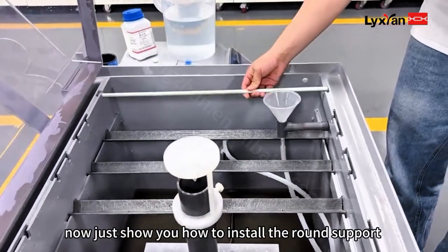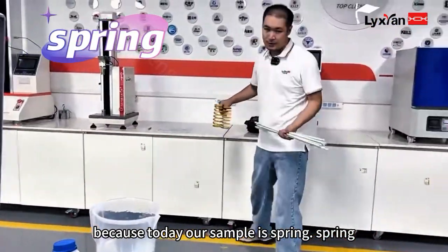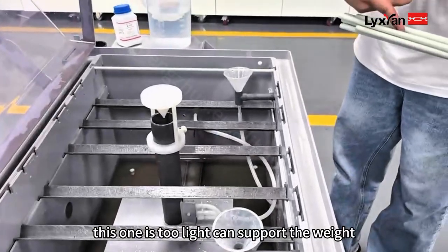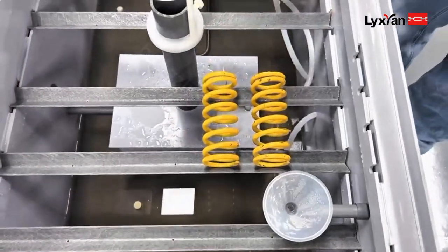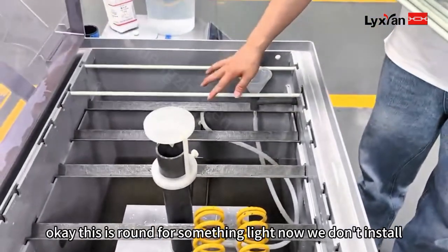Because today our sample is a screen, which is light, we use the round support instead of the V-support, since the round support can hold lighter items. The sample will be placed here on the round support.